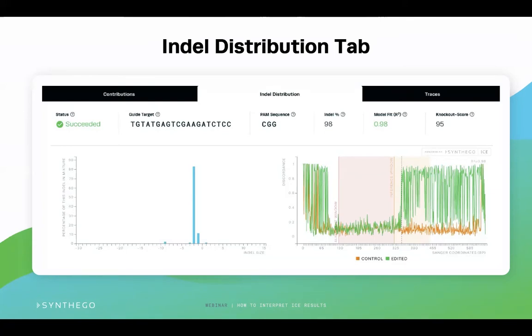The discordance plot represents the average signal that disagrees with the reference sequence. On the plot, the green line and the orange line should be close together before the cut site. This region should be long enough to allow the Sanger sequence to stabilize and allow ICE to align both sequences. As you can see here, both the edited and control sequences are noisy in the beginning, but eventually align together, with a typical CRISPR edit resulting in a jump in discordance near the cut site. The sequences will then continue to remain far apart after the cut site, representing a high level of sequence discordance.